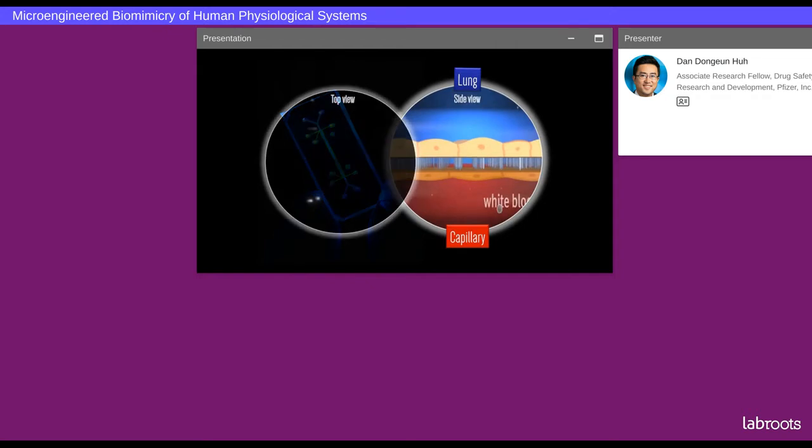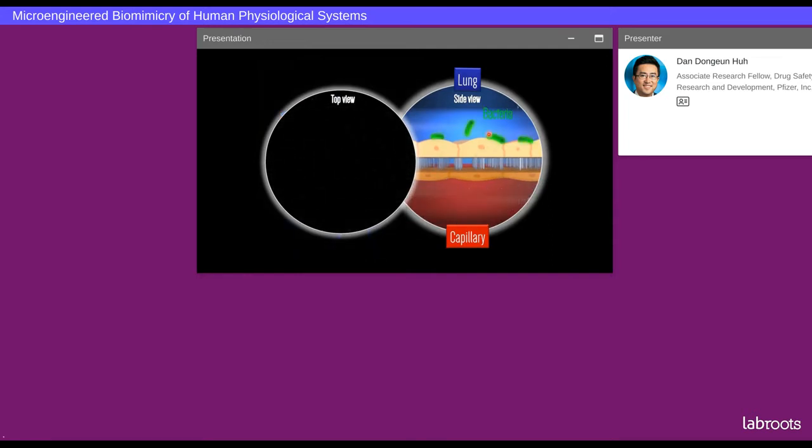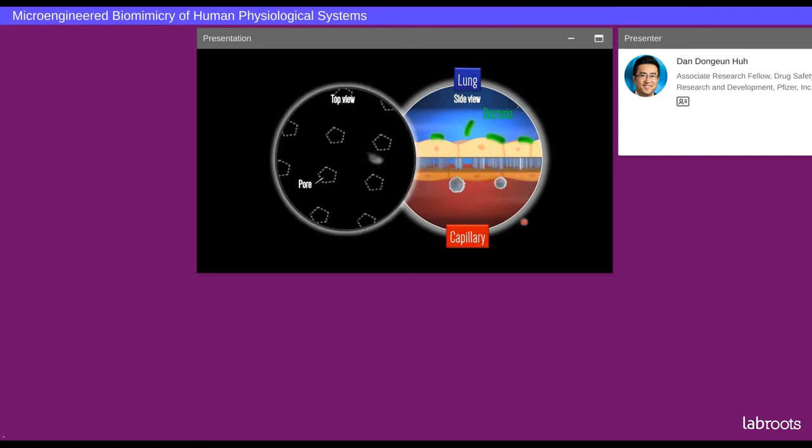So what we did was we put fluorescently tagged human neutrophils into the lower capillary channel, as you can see here. Nothing interesting happens, but in the presence of bacterial cells on the lung surface, these neutrophils now stick, presumably because these endothelial cells are now activated. And this movie shows the entire process.